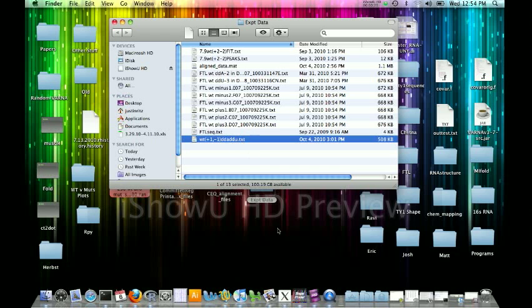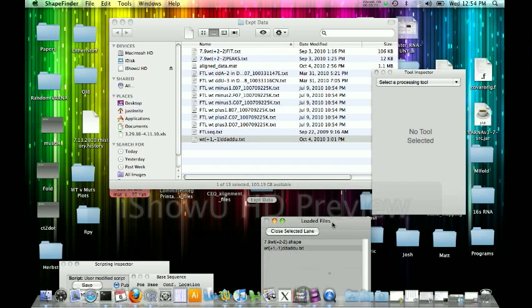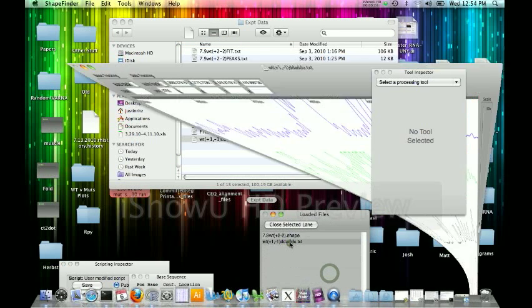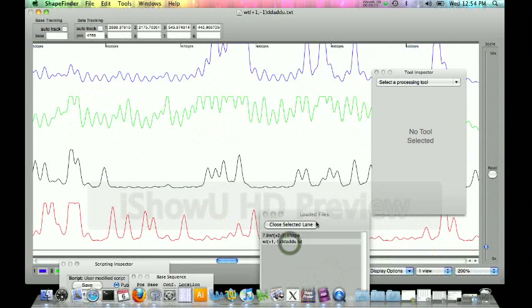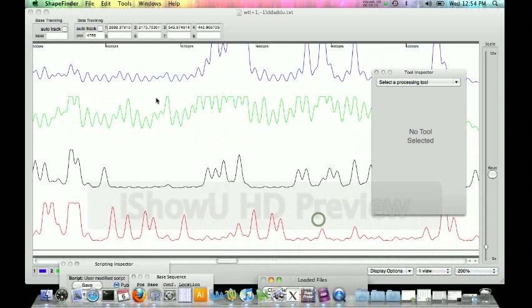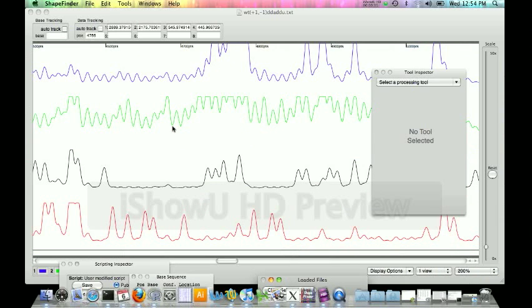When we go ahead and load that into ShapeFinder, we see that we get this. The blue, coordinating to the first filter, which is the plus reagent, green, according to the second filter, which is the minus reagent, black, which is the third filter, which is the DDA ladder, and red, which is the fourth filter, which is the DDU ladder.